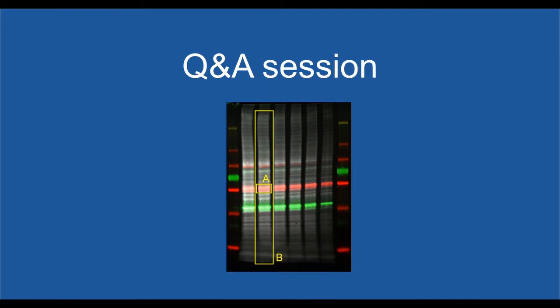But like I say, in the list of considerations when you choose your own total stain, you will be checking whether this stain will interfere with your protein of interest detection or not. Most of the time, it will not happen. But if you really want to check it and use it in your experiment, get a trial kit, test it on your sample, and see whether it's interfering, or whether you can see residual signals on your protein of interest. That's pretty quick. Then you see whether you can use this or not. I'll say it's checking or qualification before you really opt for that kind of staining.